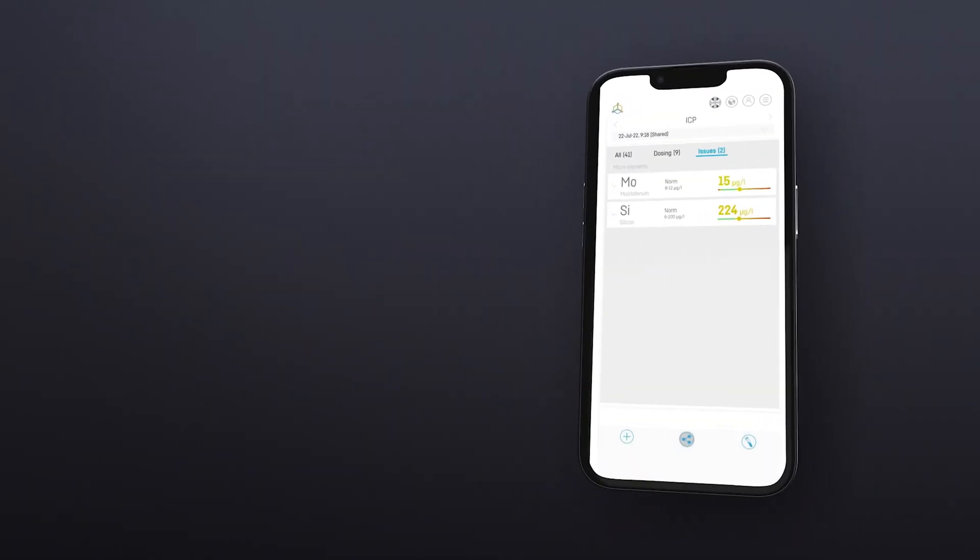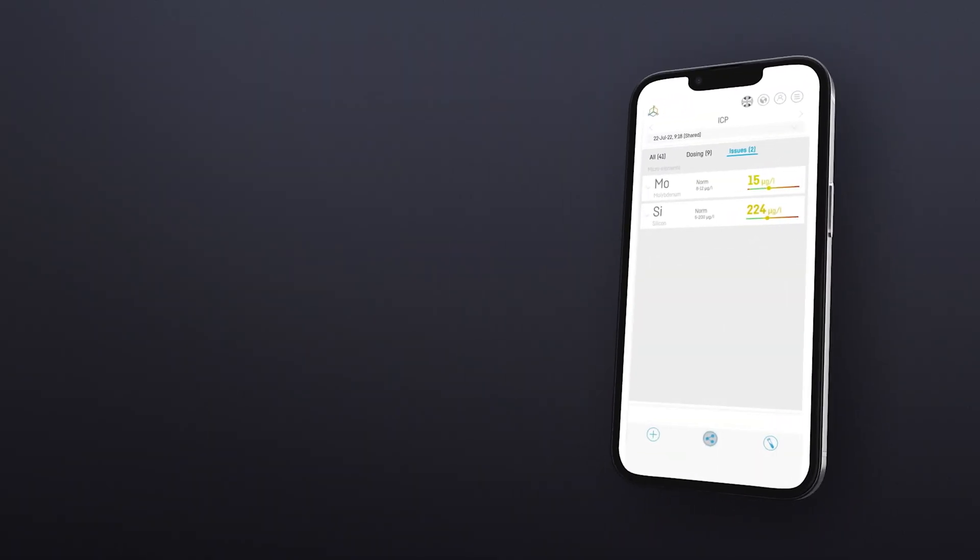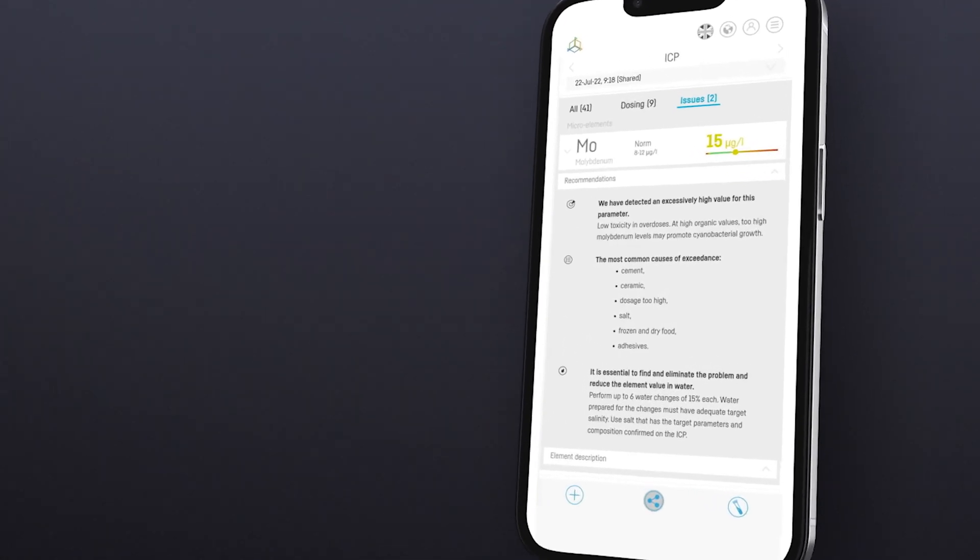And Issues, where we can find micro and macro elements with excessive values of impurities. After expanding the parameter bar, we access recommendations, element description, and measurement history.